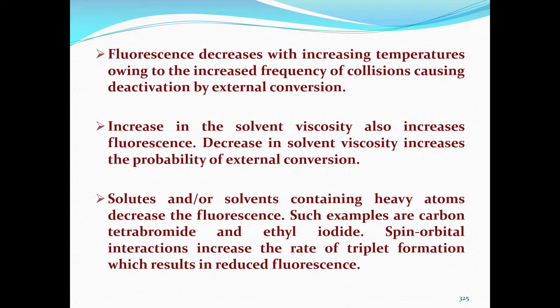Other conclusions that we can derive: fluorescence normally decreases with increasing temperature owing to the increased frequency of collisions causing deactivation by external conversion. This is a very simple phenomenon, because as the temperature increases, molecules move faster and gain kinetic energy, and once the kinetic energy of all the molecules is very high, the collisions will increase and the fluorescence intensity will come down.